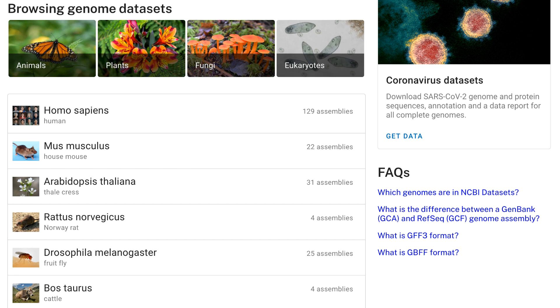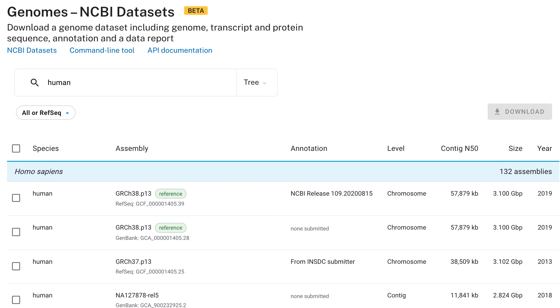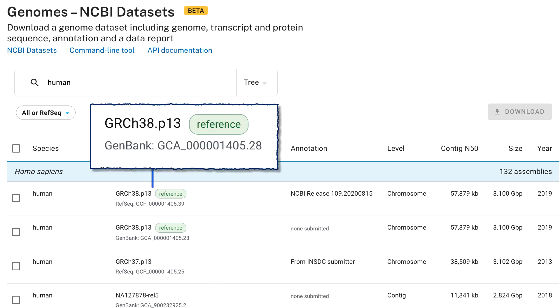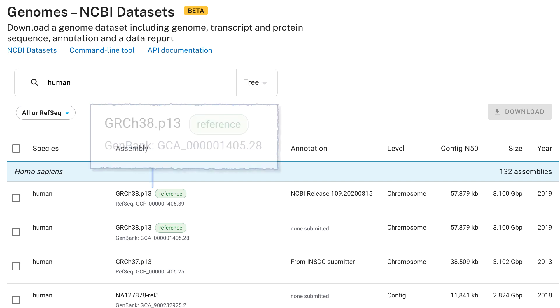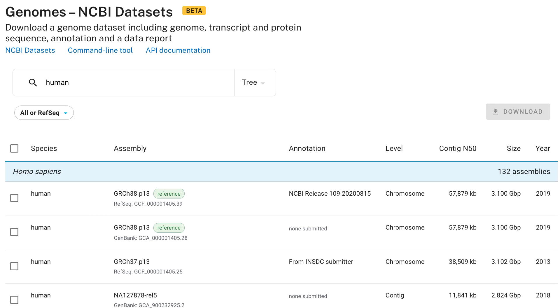In the Browsing Genome Datasets section, we have links to popular organisms, including human. Click on human to go to a table of all the latest RefSeq and GenBank genome assemblies for human. The table shows you all available assemblies, and the latest RefSeq reference genome is at the top. Within the row are some basic stats such as genome size, contig N50, and the latest annotation release number.